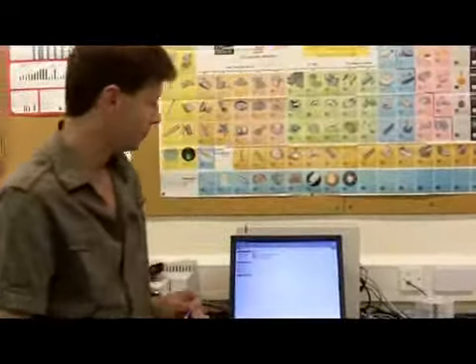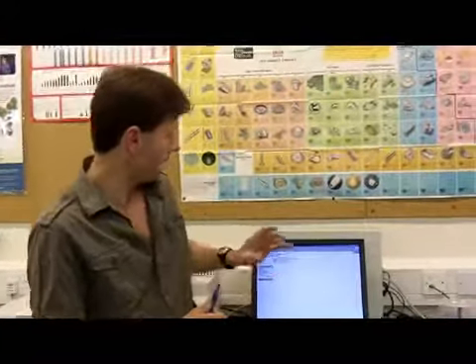Okay. Now, the really fun part is that you're now going to look at the surface at atomic resolution. And to do that, we use a technique called scanning tunneling microscopy, which I know you've heard about. So, on the disk, you'll find the data from those images, and you'll need to use a program to analyse the images. So the program we're going to use is also on the disk.